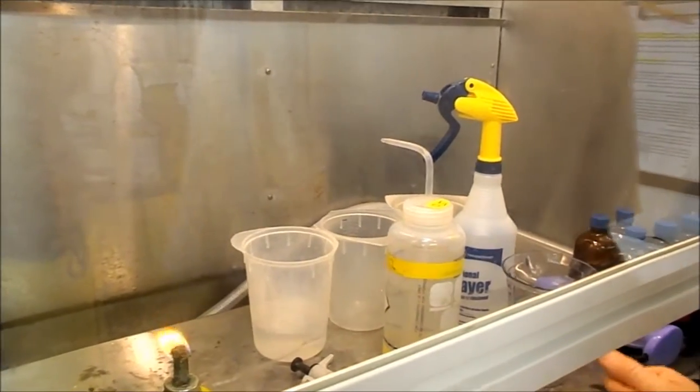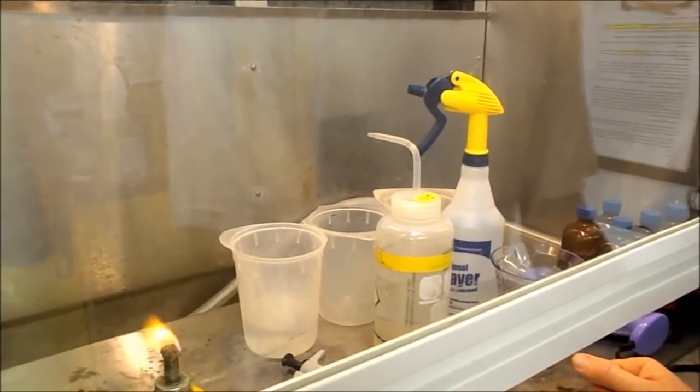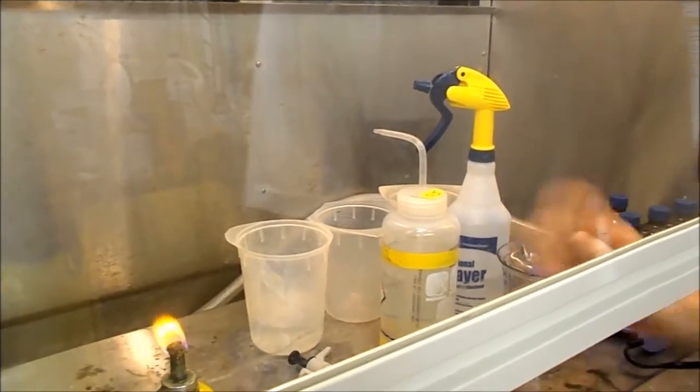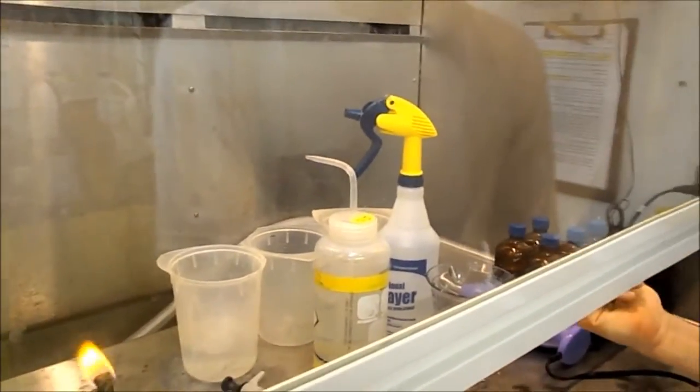Now the tips that you take, do you assume that they are clean, or do you also sterilize them? Yeah, I soaked them in this, and I soaked them in DI. Okay. And then dried them out. Very good. And these I stick in the oven overnight.